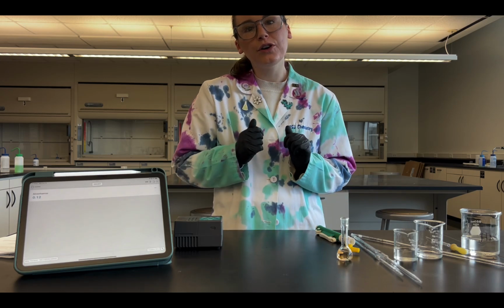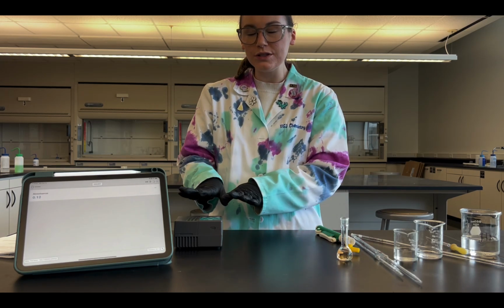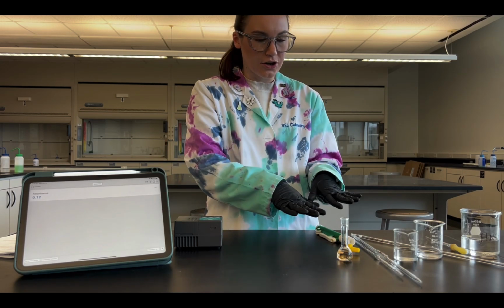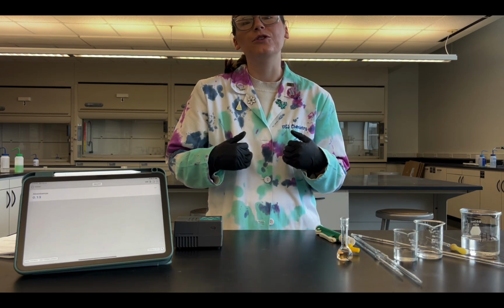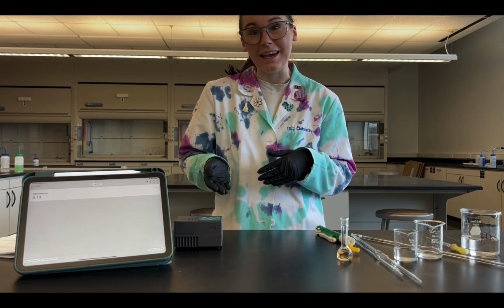So let's go over to the board and talk about how we can use this absorption information and our current dilution, along with our previous y equals mx plus b relationship, in order to start filling out those ice tables and start to calculate K.